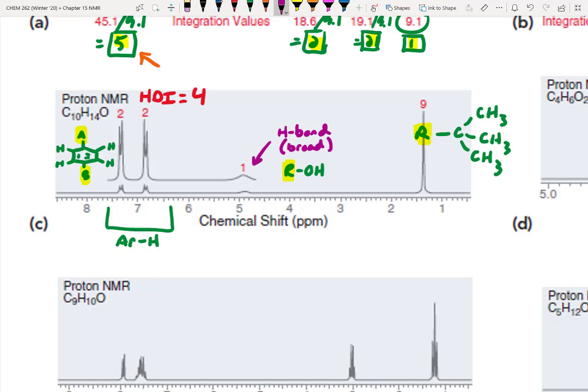If we think about this proton set here, it's going to be the same as the other methyl groups. I said methyl groups spin around like helicopter blades and kind of blur out on NMR. In this case, all 3 methyl groups are like a set of propeller blades on propeller blades, so they're all averaging out to be the same. So in this case, this makes sense.